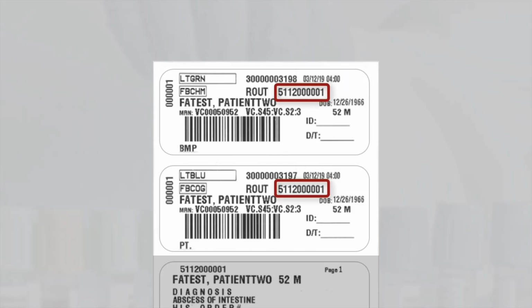Next is the order number and the order number abbreviation. And we have already looked at what tests are ordered. If multiple tests are requested that can have the same tube type, then you could have multiple tests listed on the same label. This is the workstation. This information is different for each hospital and will determine where your specimen should be sent.